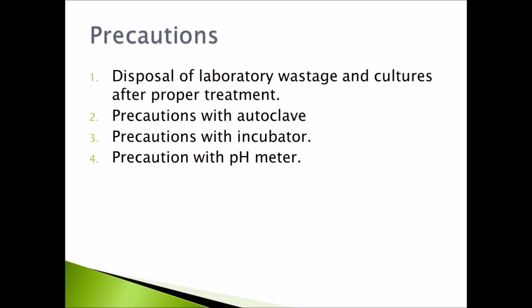The acid should be handled carefully. Care should be taken that stains or acids must not contact with the skin. Stains should not be allowed to boil because overheating of root tips would damage the chromosomes.